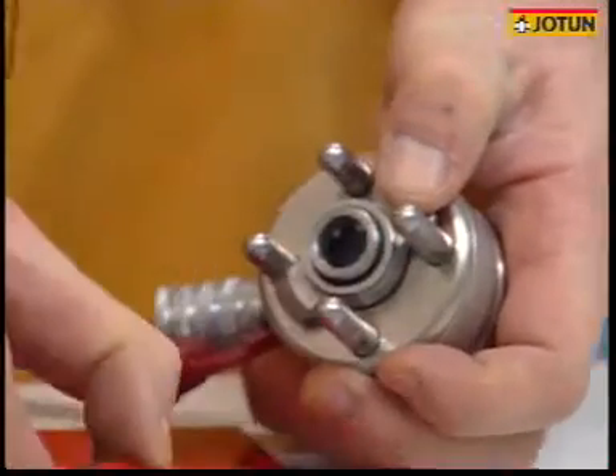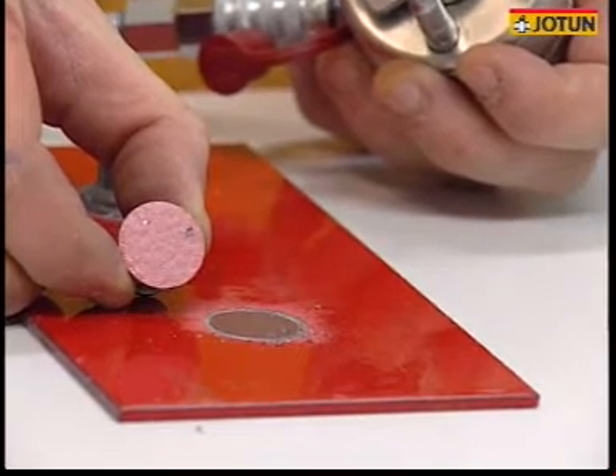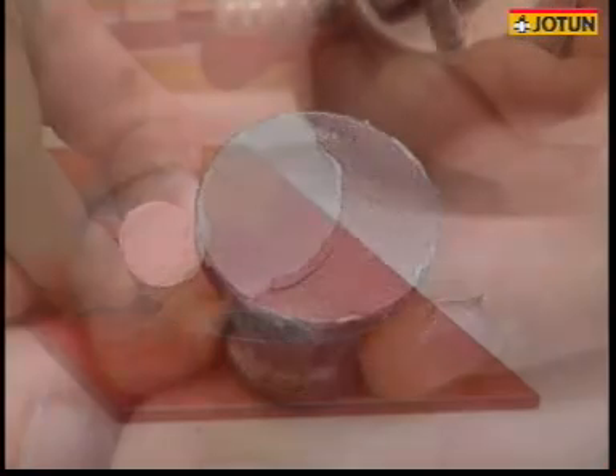It's important not only to look at the pull-off value, but also to look at the type of failure. This could be adhesion failure between coats, adhesion failure to the substrate, or a cohesion failure.